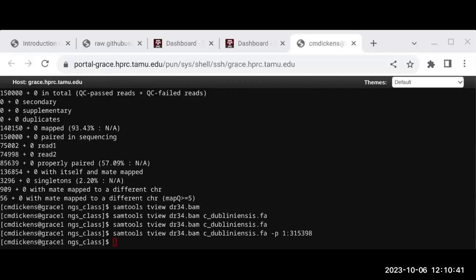The good thing about this is it's already installed. All the dependencies are there, and basically you're replicating their software installation. One of the cons is sometimes the image isn't available for the latest version of a software. You have to wait until someone generates the image if you don't do it yourself. But some software may only be available as an image.